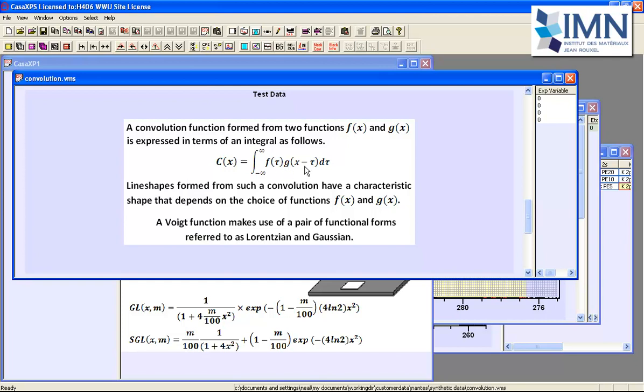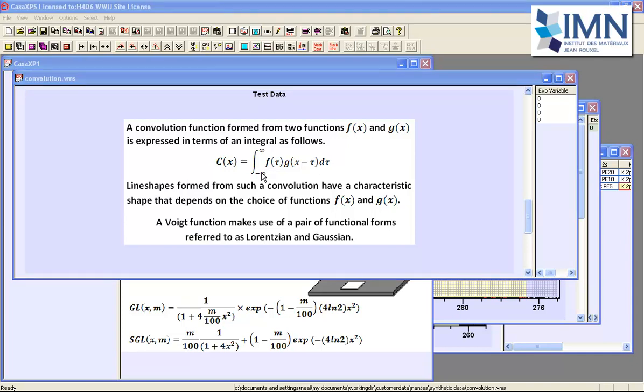So the product of this top hat function with the Lorentzian is simulating what the detector is doing, integrating over an interval of a Lorentzian. It's perhaps easier to look at this convolution integral graphically. Now the thing to look for is that at any given x value we're going to calculate an integral which represents an area that is formed from the product of the Lorentzian and a top hat function which is offset from the Lorentzian by this value of x.